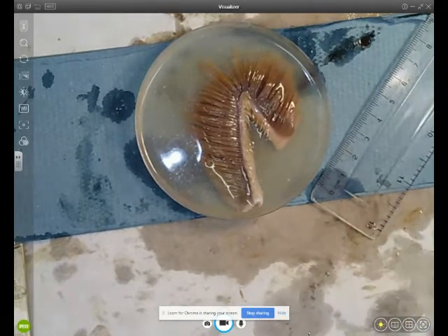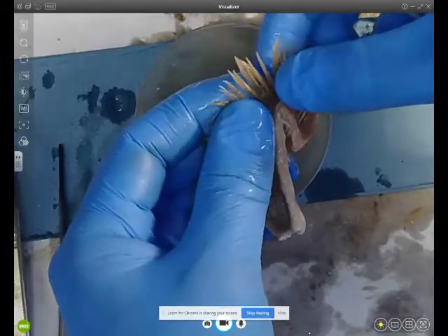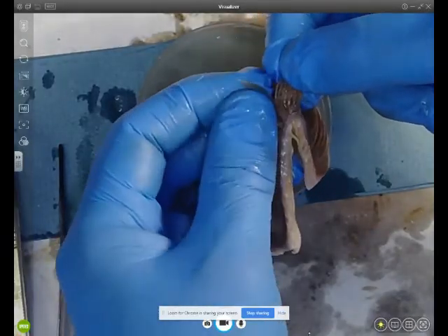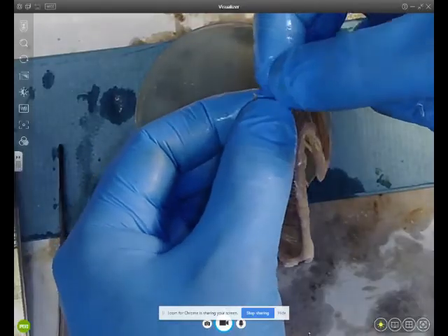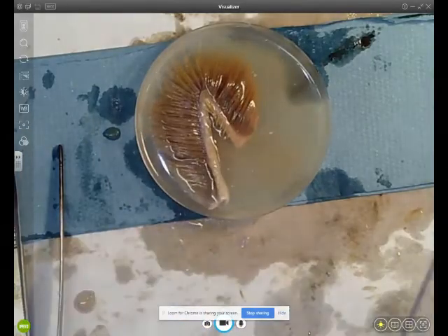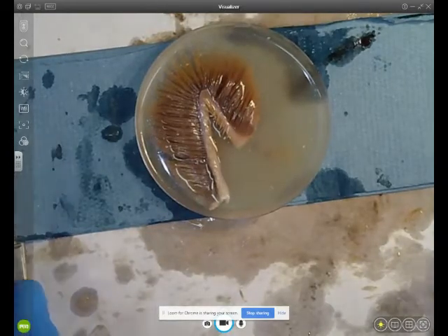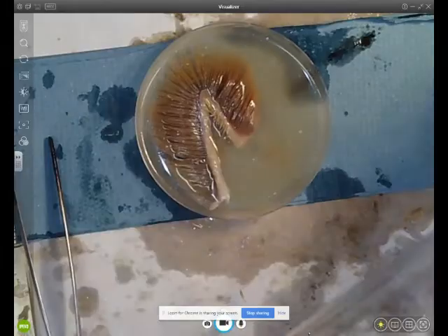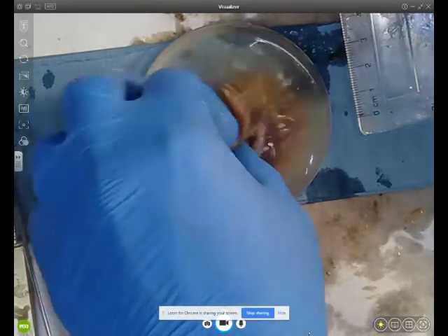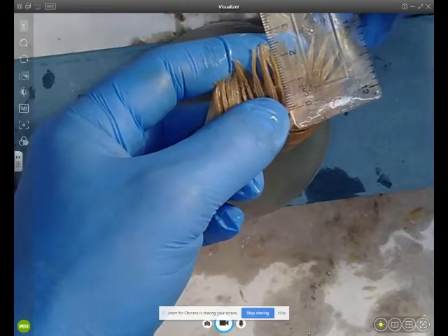I would record that in a table and also record the width and length of a gill filament, then try to work out the total surface area of the gill or both gills. I'm measuring the length of one gill filament — the width and then the length — and it's around about 25 millimeters.